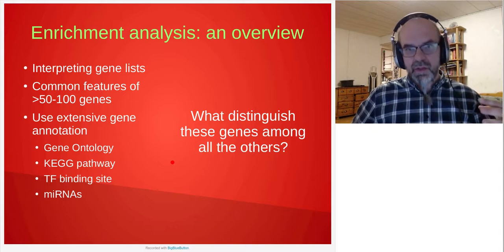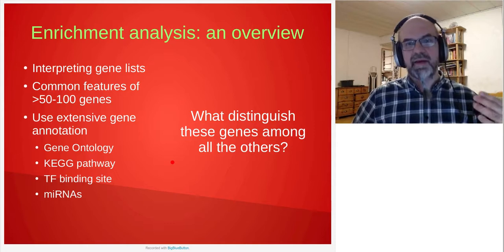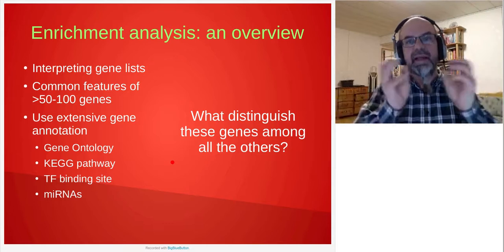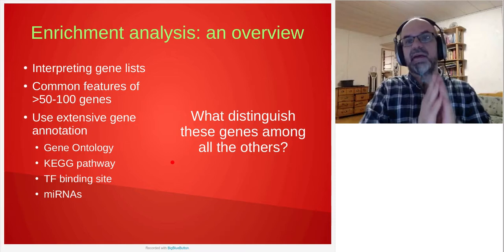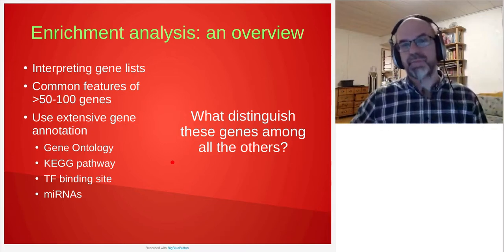So I will show you today how to use annotation and analysis of this annotation of these genes to identify features which are enriched among those genes that we select from a larger background population. Very often today we identify a handful of genes from the entire genome.